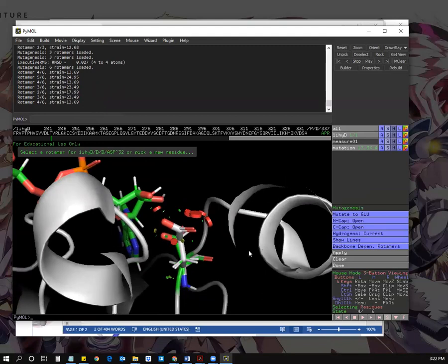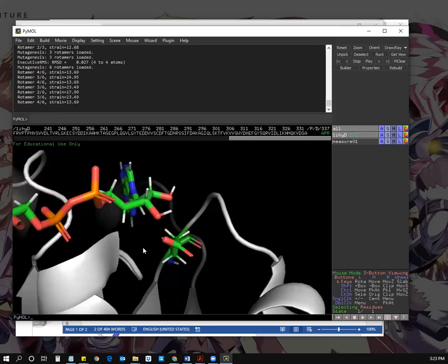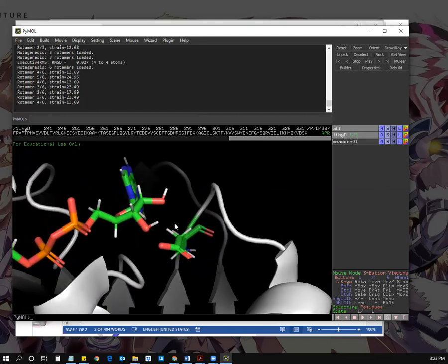Once you're done choosing your desired mutation, then click apply, and the apply step will remove the old amino acid residue. It'll make your mutation happen, and then the wizard starts all over again, because over on the upper left side, it's saying pick a residue. So you're still in the wizard in case you want to do another mutation, that's fine. But I personally am done with this, so I'm going to select done in this wizard dialog box and get out of the wizard before I start mutating the whole darn protein.